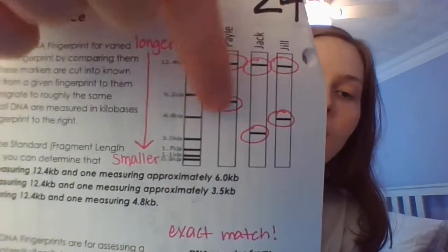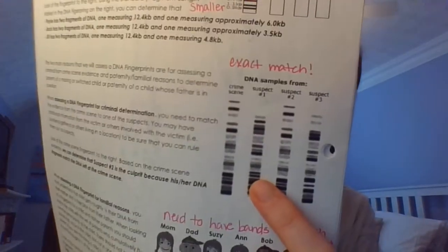Okay? So do you notice how all of their bands are different? And sometimes they might not even have the same number of bands, and that's just because everyone's DNA is different. So this is how we can eliminate suspects and say this was your DNA found at the crime scene, or how we can say you are the parent of this child, if you have a known parent of the child. So this is the type of thing we're going to look at when we are identifying suspects. Now, when you're identifying suspects, you need an exact match, okay? They have to match every single band, because you want to make sure that the suspect is the person who did it. And if they're the person who did it, their DNA should exactly match the DNA found at the crime scene.